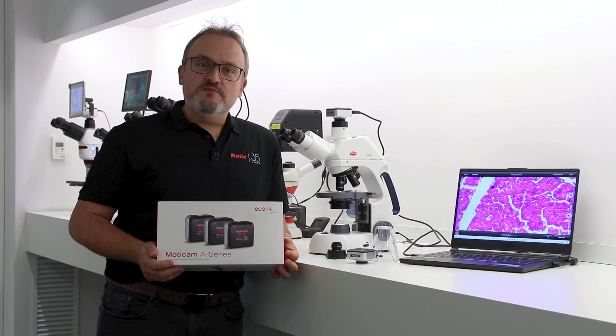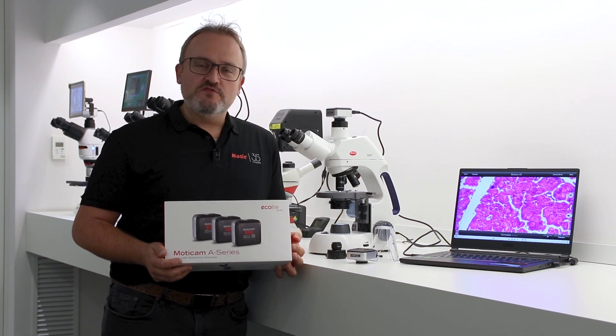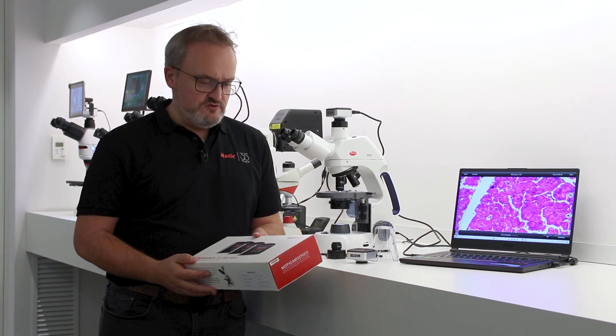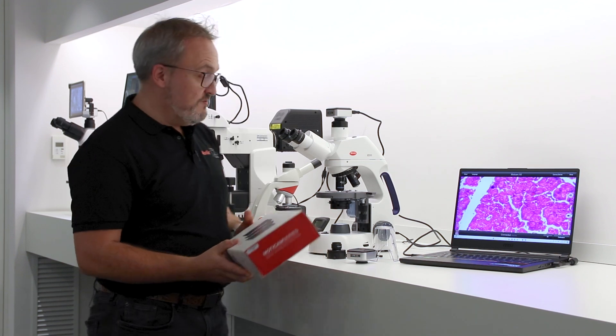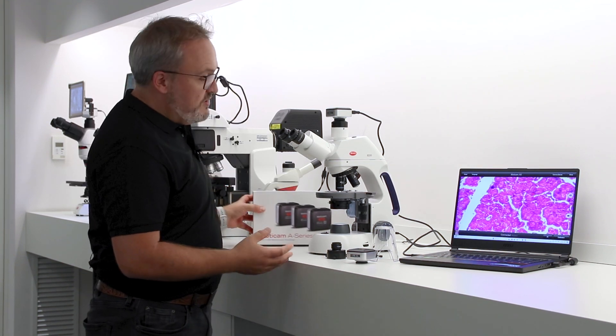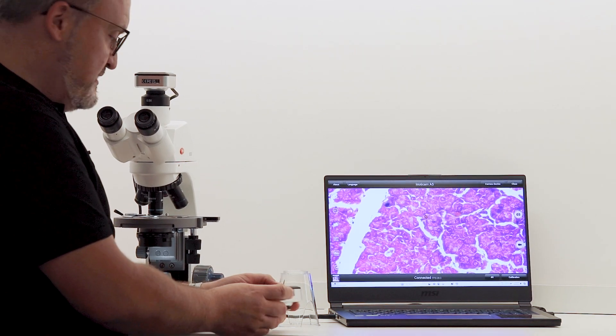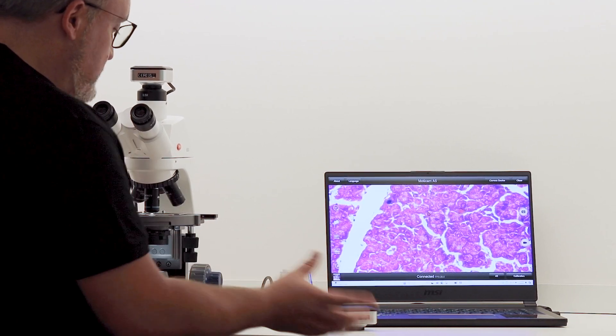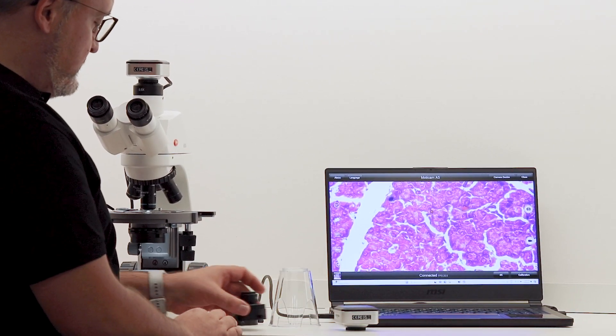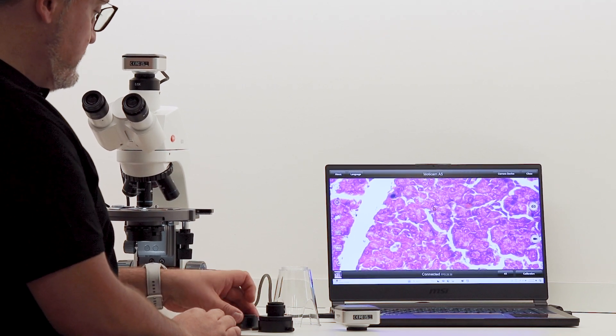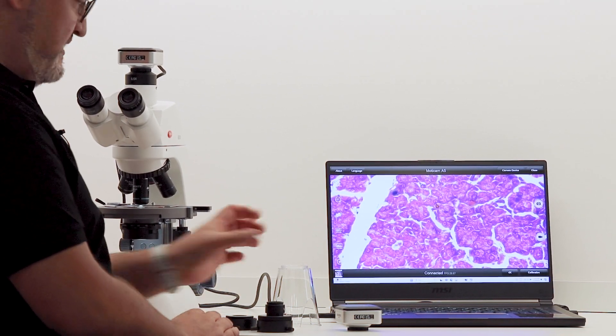The A-Line MOTICAM is part of our all-in-one-box solutions. This means not only do you get the camera which can be connected through USB to your computer, but also you get a focusable lens, two different size eyepiece adapters, and a macro tube.